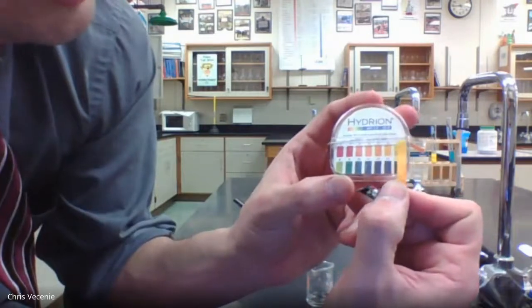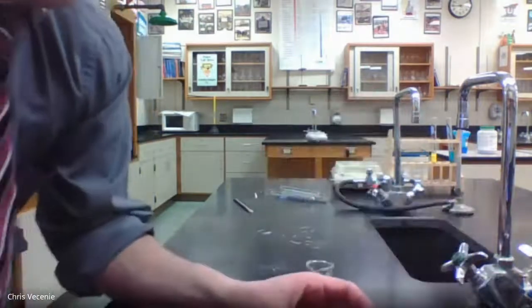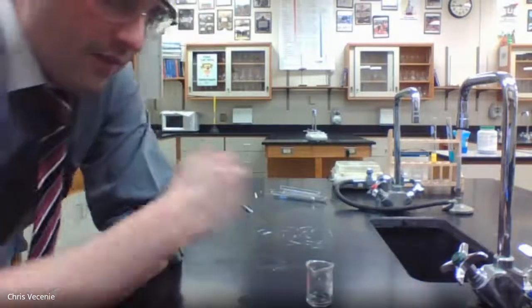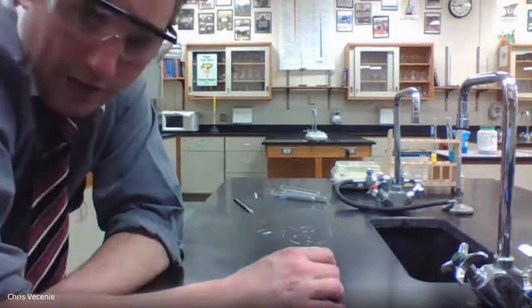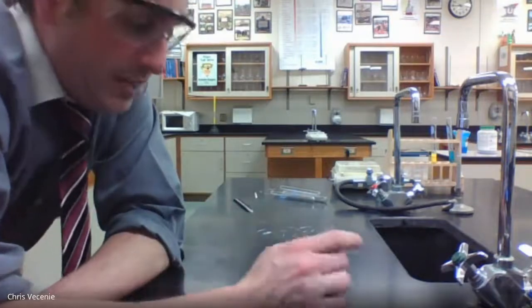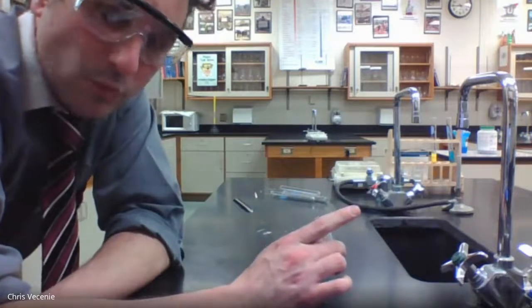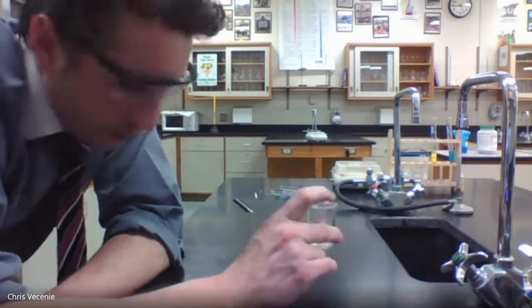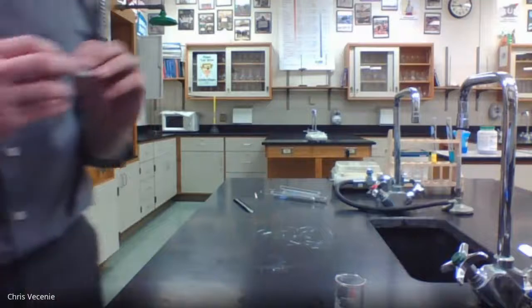right over here in this sort of greenish orangish, which puts us in the pH range of like 6. All right. Somewhere between 5, 6, or 7, for the plain old fashioned water. All right, now we need to do that because what we're going to do is take the products from experiment 4A and dissolve it in this. So right now, what I'm going to do is conduct experiment 4A.